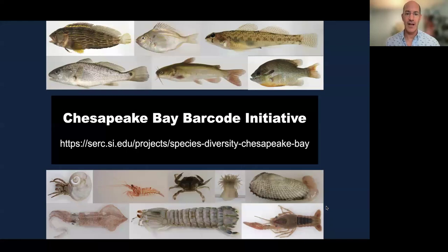So how do we do the library? This is one of the other big projects that we've been working on in my lab over the last 10 years or so. You need to have a reference library, and the way to get that reference library is to sample and sequence the DNA of all of the species that live in your area.